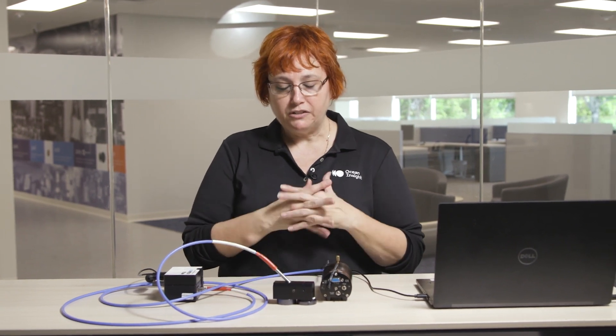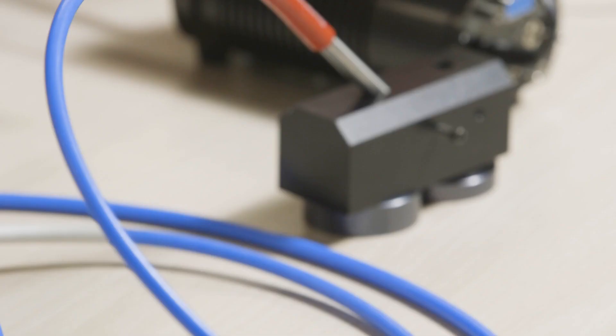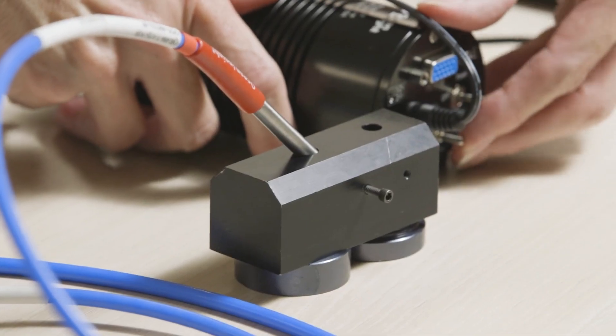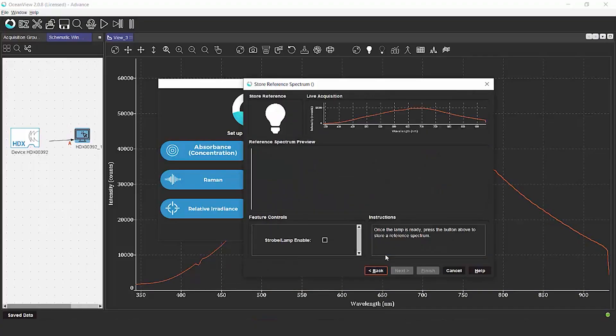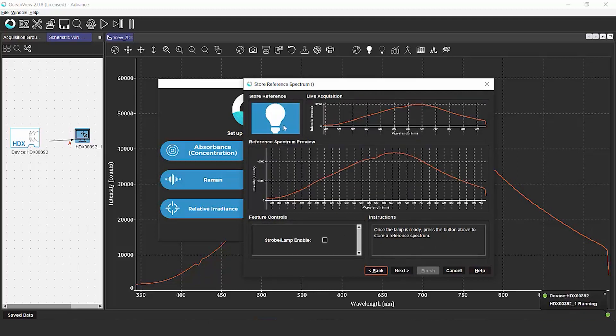We click next to collect our reference and our dark spectra. We're already all set up for the reference spectra here. We just need to make sure to open the shutter on our light source so that we're illuminating the reflectance standard. We're going to click the light bulb to store our reference spectrum. Once that's been stored, we're going to click next.